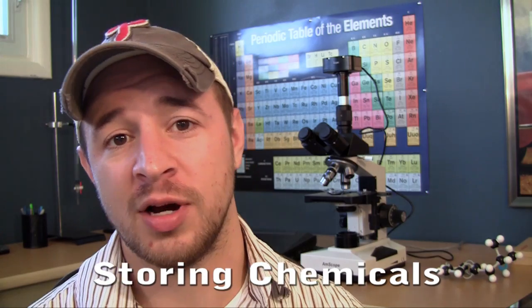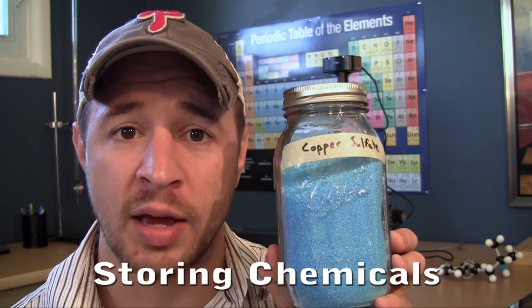What's going on guys? It's Bucky again and welcome to another amazing chemistry tutorial. In this video I want to talk to you guys about storing chemicals.